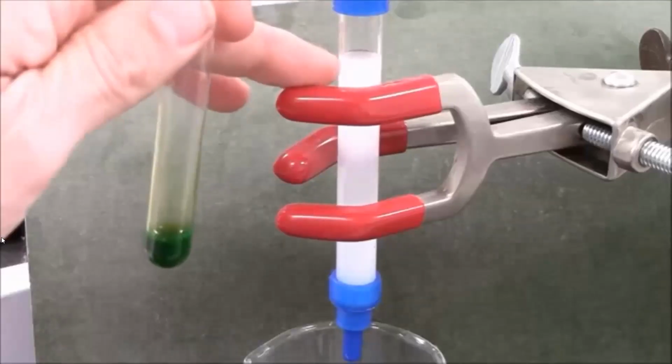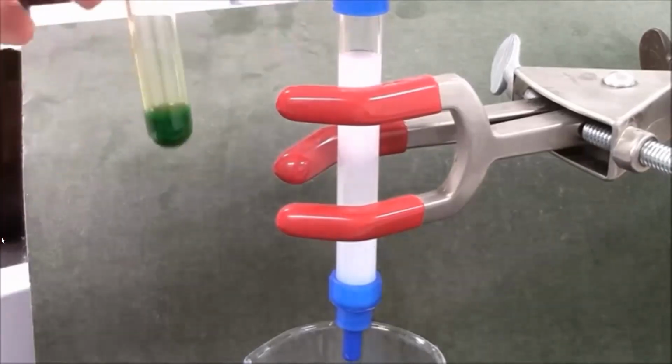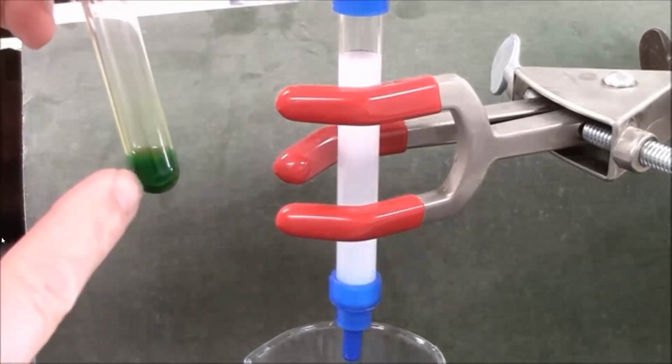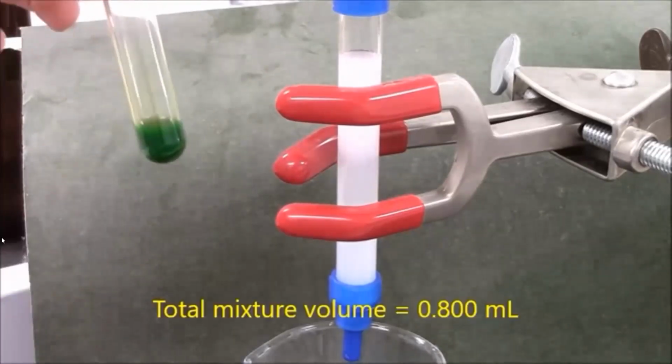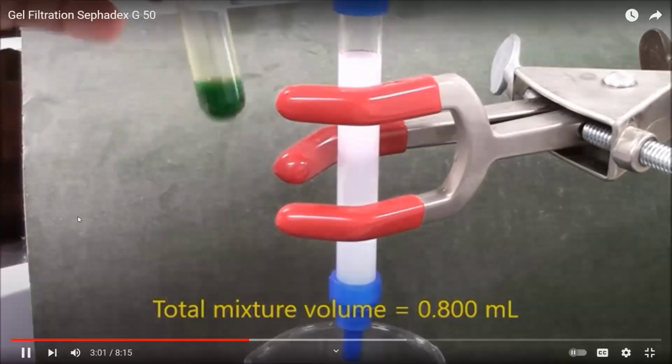I've drained the buffer, so now there's no residual buffer on top of the gel, and I've made a mixture of a total of 0.8 milliliters, 400 microliters of the fluorescein, 400 microliters of the blue dextran. Nice green color. I'll separate these.